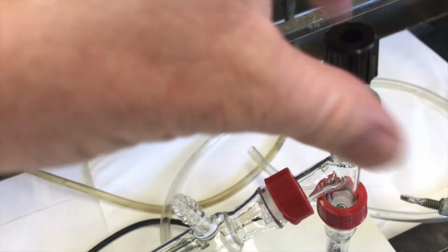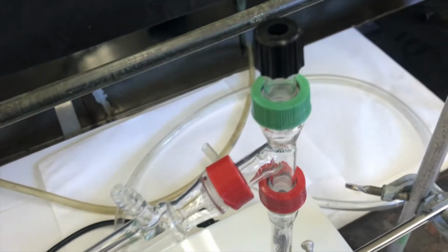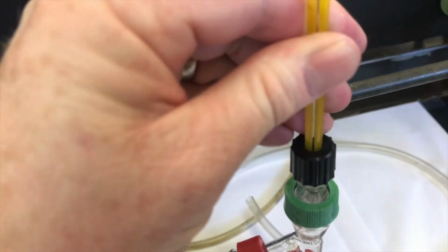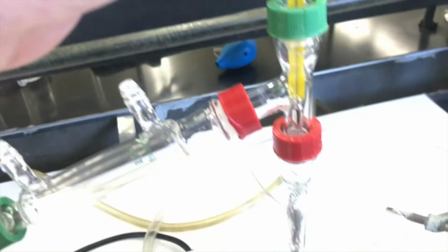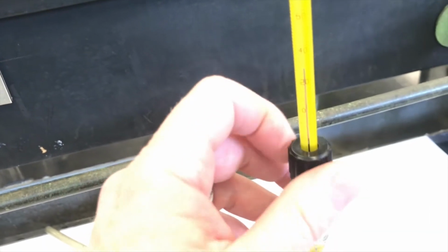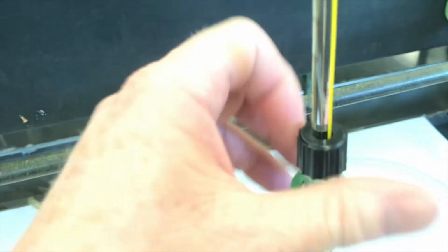And the way it works, it's real simple, but it's a good idea, is I'll take my thermometer and I'll stick it through the cap. And when I push it through, it's resisting a little bit with that O-ring. That O-ring is letting it go through. And then when I get it to the height I want, right about there, I can tighten this here and it'll pinch down on that O-ring and really grab the thermometer tight, so now the thermometer won't go up or down. And then when I want to take it out, I loosen it and bring it up.